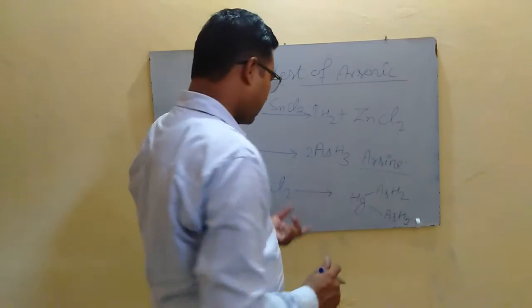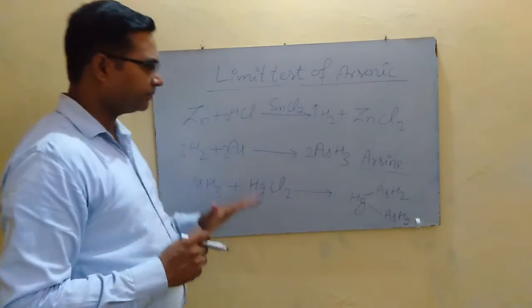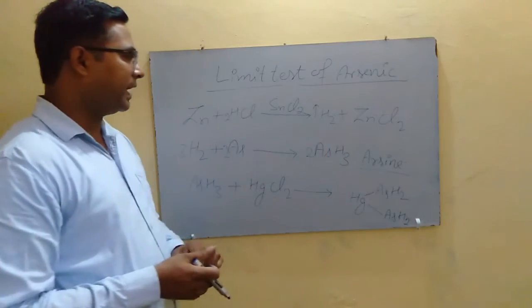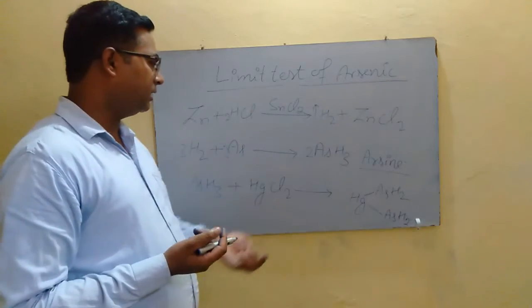The color of this yellow stain is compared with the standard stain that is developed by taking a standard solution of arsenic.